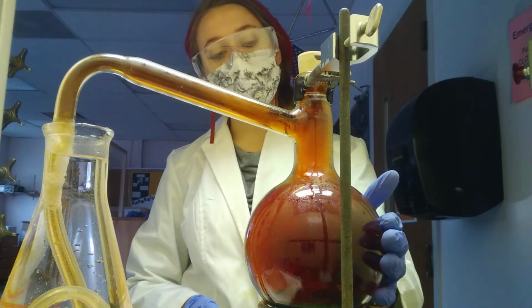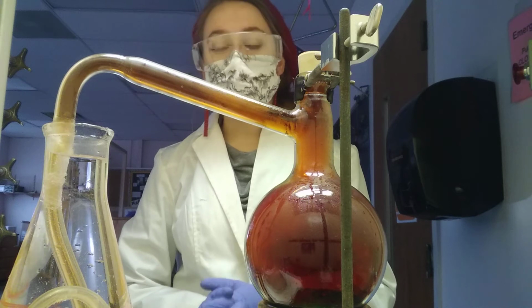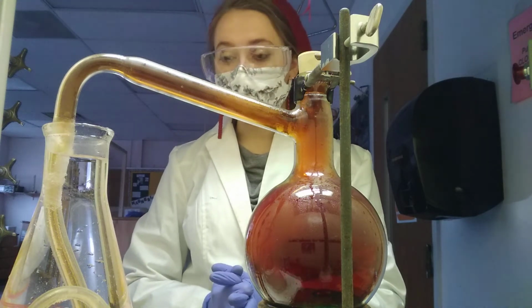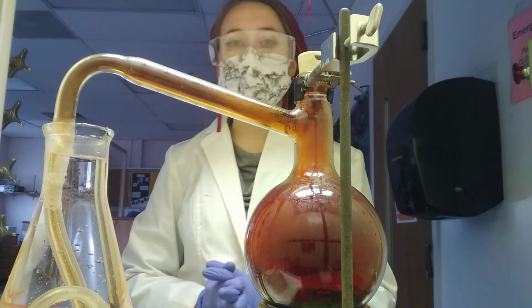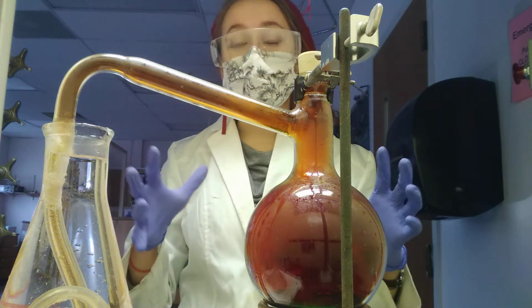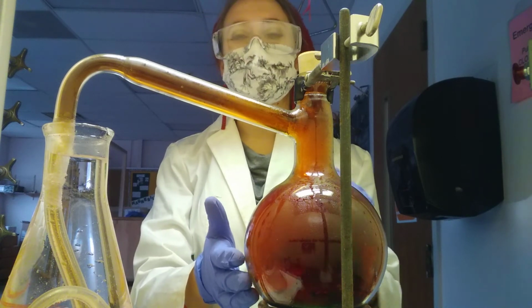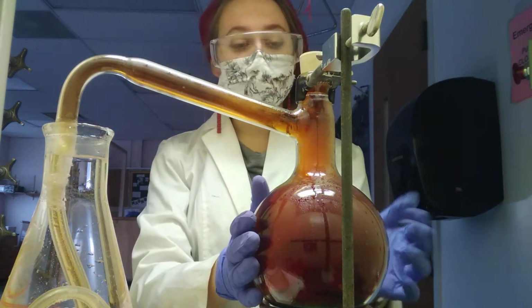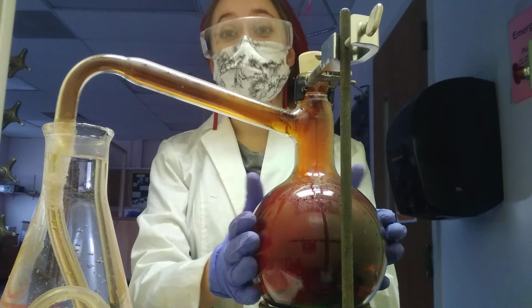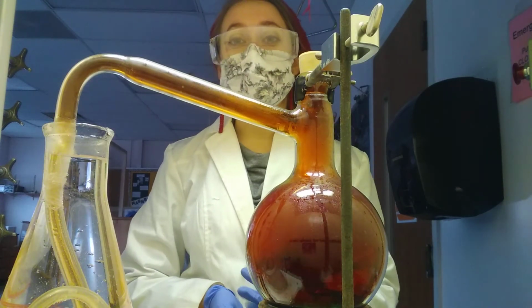So when we look for signs that there's a chemical reaction, there are a few things that we look for. They're not always going to be present in every reaction. One of them is a temperature change. The container might get warmer, the temperature might go down or go up. In this case, if you feel the outside of the flask, it's very warm. So that's one indicator that there could be a chemical reaction happening.